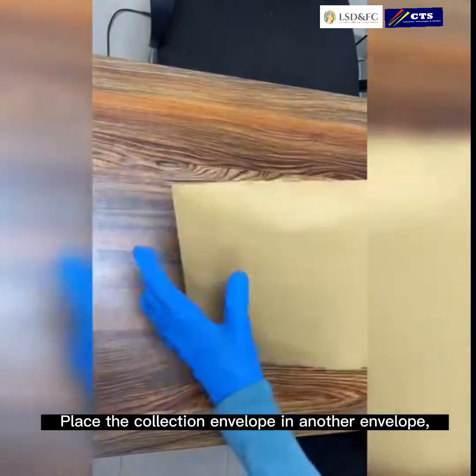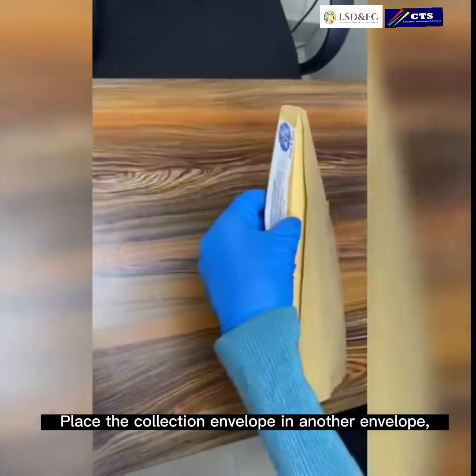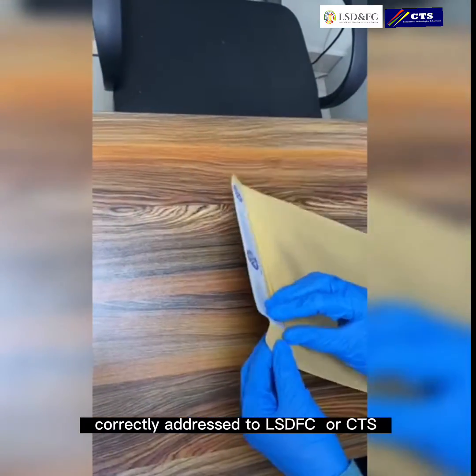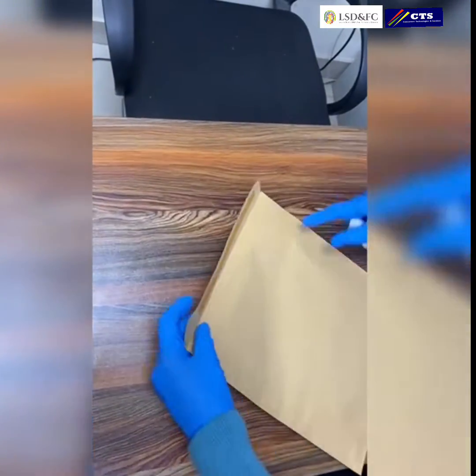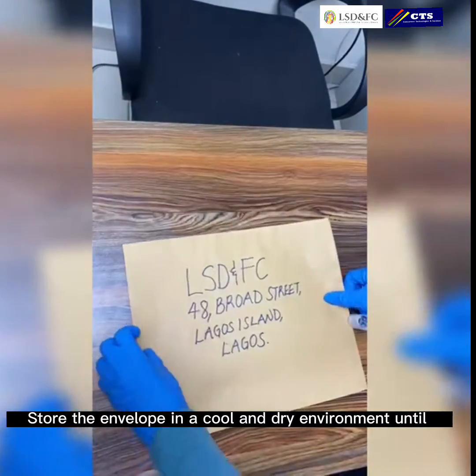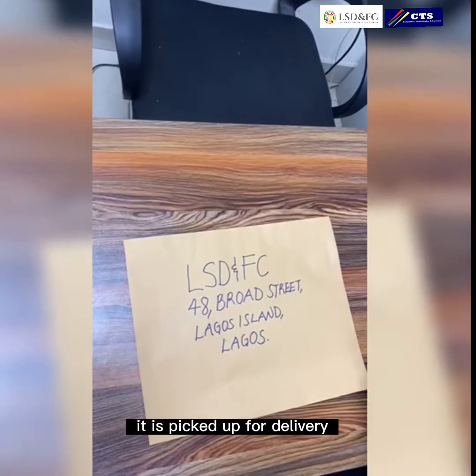Place the collection envelope in another envelope correctly addressed to LSDFC or CTS. Store the envelope in a cold and dry environment until it is picked up for delivery.